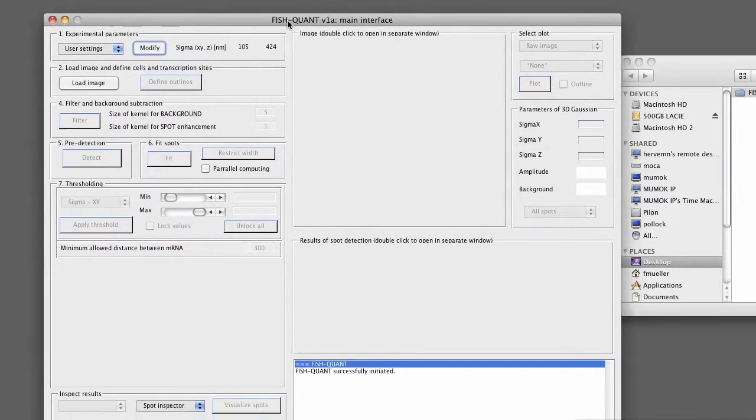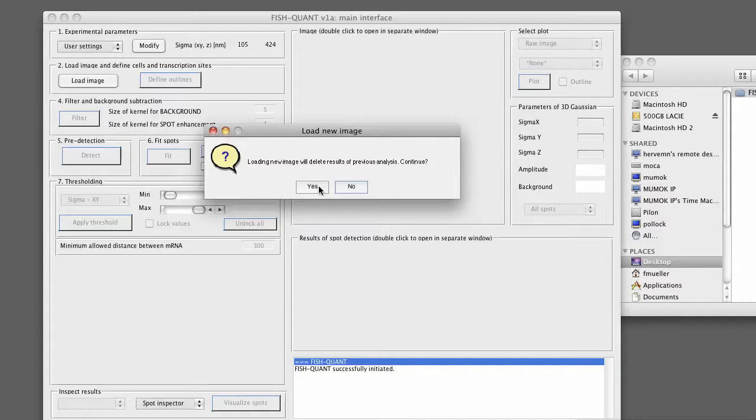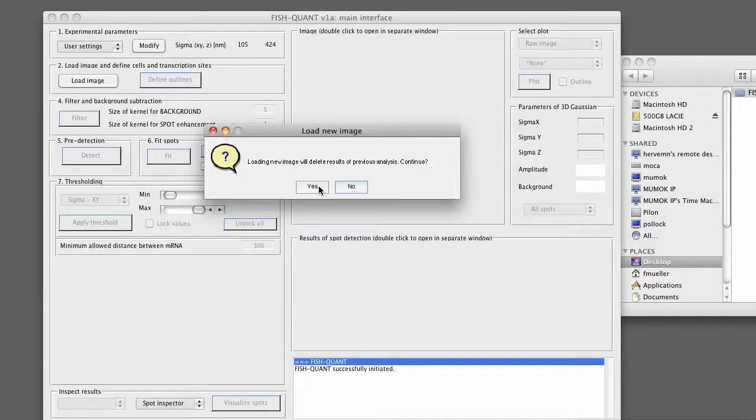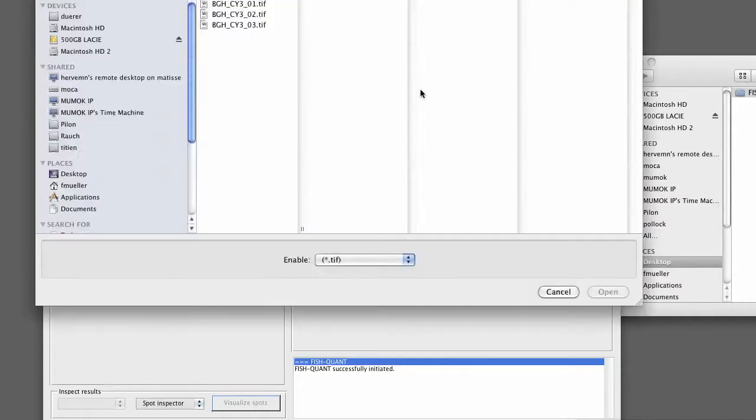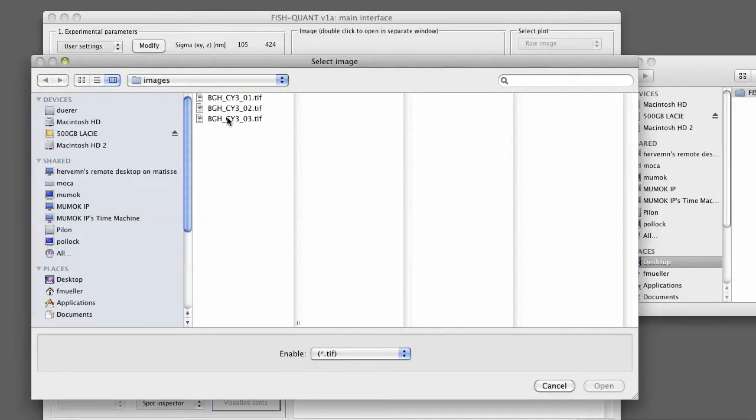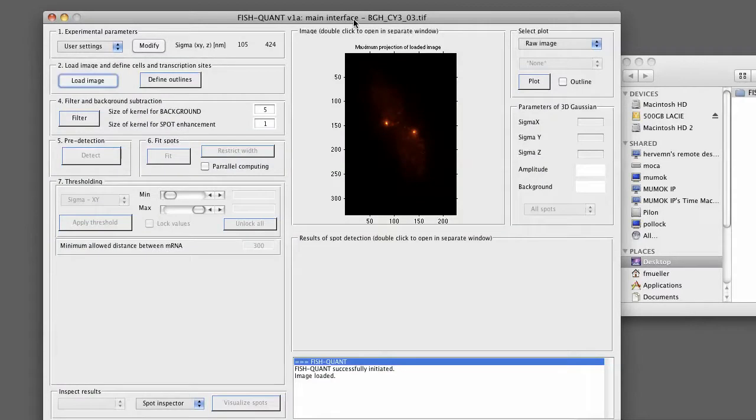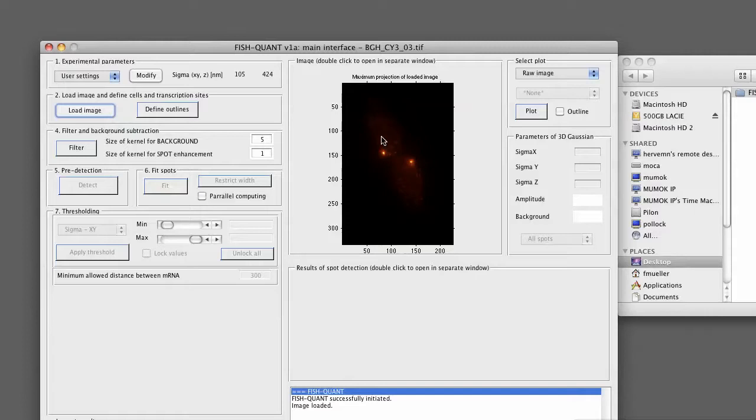Then we can load the image data. This can simply be done by pressing on the Load Image button. Each time we load a new image, the analysis results of the previous analysis will be deleted. So we just confirm this. FishQuant will automatically go in the image subfolder that we specified. Here we select a third image. It will be loaded. You see an image with two cells, two transcription sites, and a number of nascent transcripts.